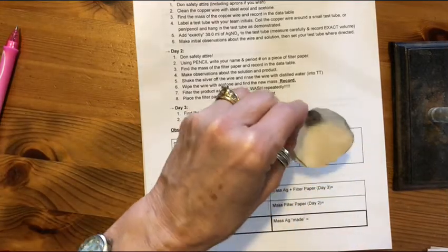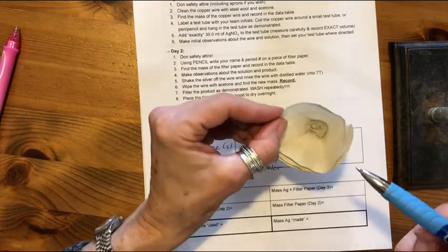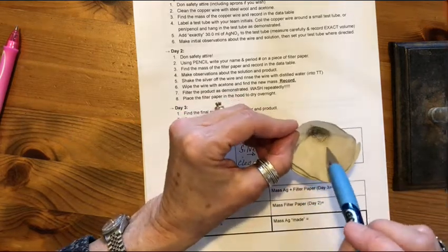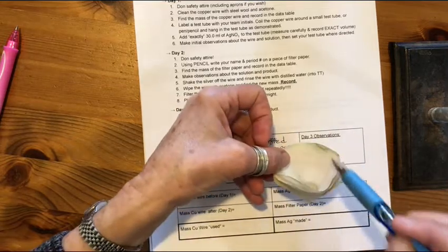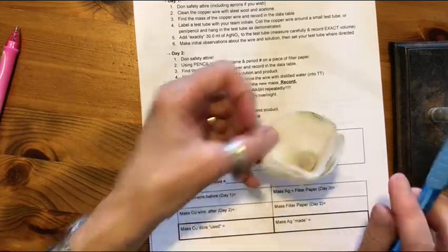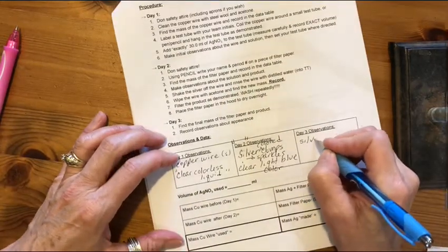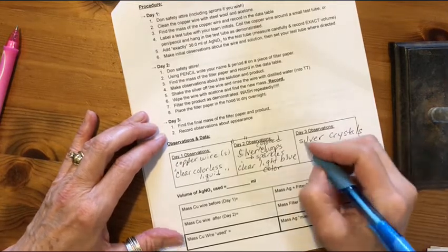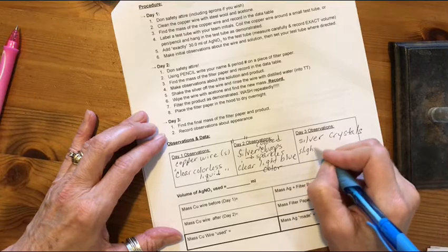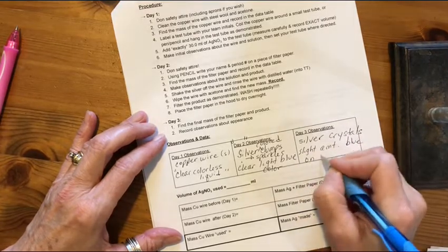And then again, today's solid silver has some sparkles to it. You probably can't see it on my phone video, but you can actually see little needles of the crystals. And then again, there is some blue tinging on the top. Not too bad, but there is some blue tinge on the filter paper. Silver crystals, and slight amount of blue on filter paper.